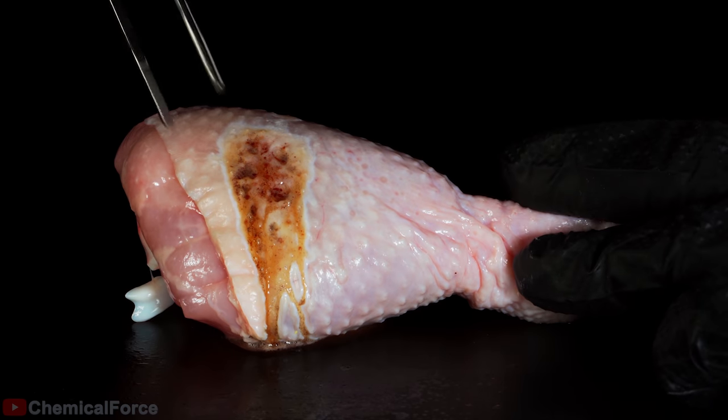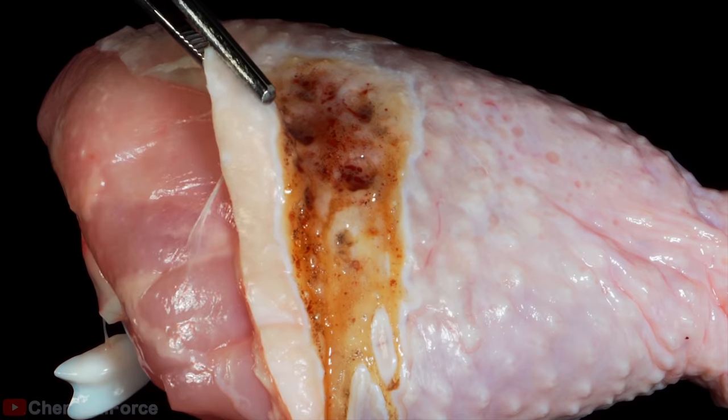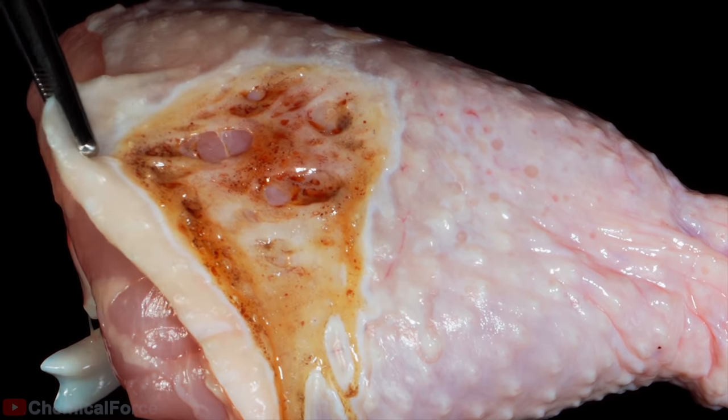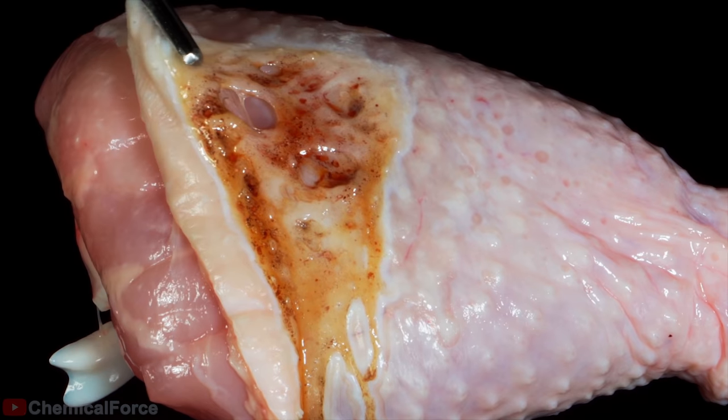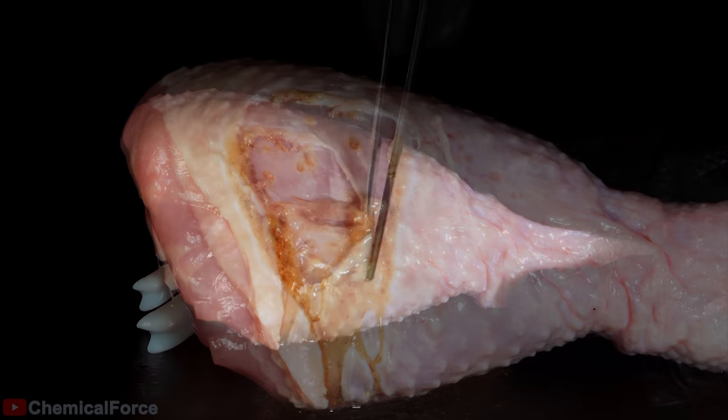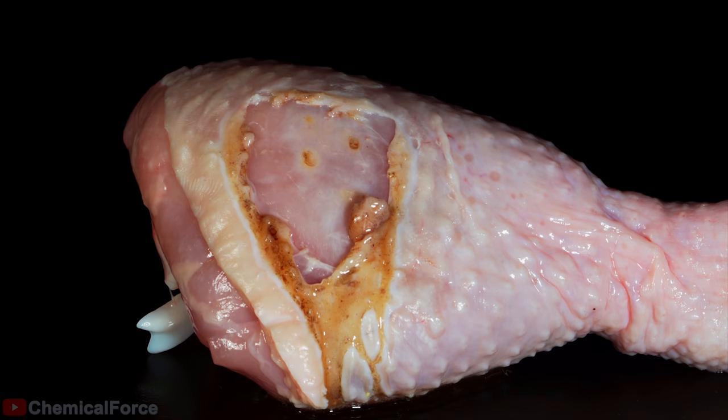The skin is very similar to human skin in terms of properties, so you might say the consequences of getting the superacid on an unprotected section of your body would be the same. Now it's time for the meat and for the bone.